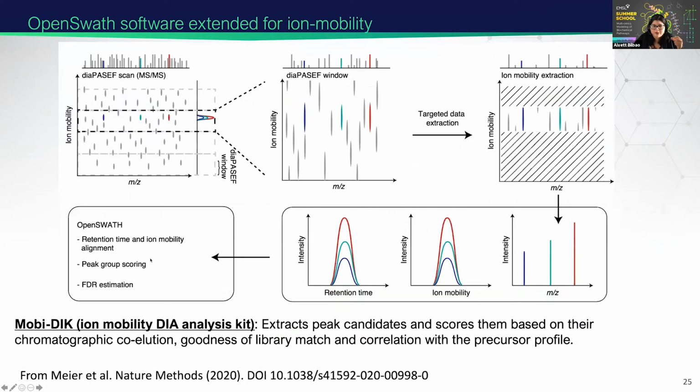Another tool that was adapted to process ion mobility data was OpenSWATH. Basically, they extended the model that they implemented for SWATH or DIA LC-MS, typical standard DIA, and extended the same scoring model by adding properties that take into account peak shape and properties from the ion mobility dimension, to compare these against libraries again.